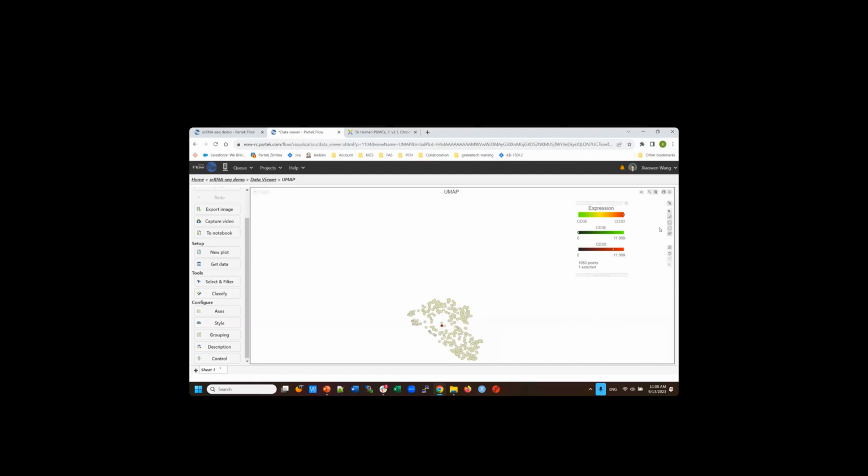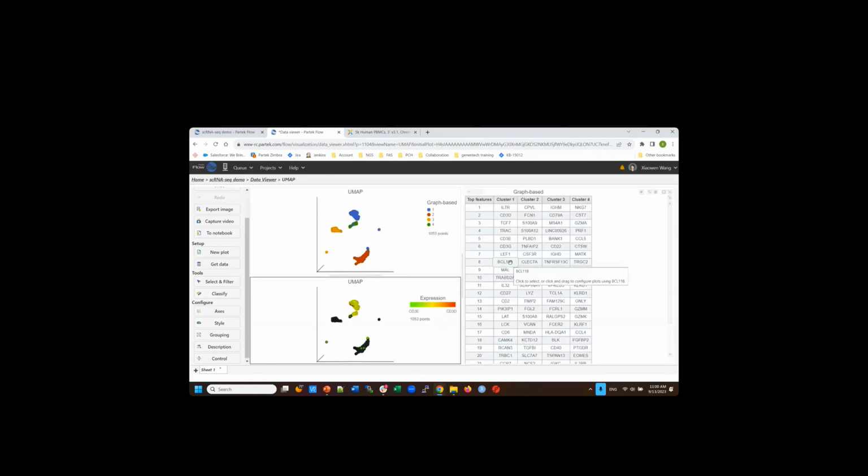It's because of the technology. That's why nowadays everybody tries to do multi-omics. So you want to use a different perspective to try to capture the information. You can use a protein, for example. Anyway, that's how much answer we can get from here.